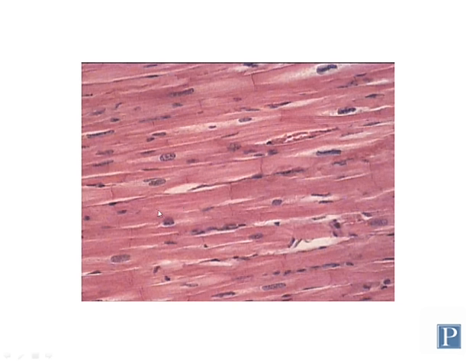So some of them have two nuclei or binucleate, but don't have dozens or hundreds of them that you see with skeletal myofibers. Cardiac muscle cells also tend to branch, so there are many branching points here, and for that reason they don't all sit flat together as nicely as skeletal muscles do, so you can see some gaps between the cells that is absent in skeletal muscle tissue.